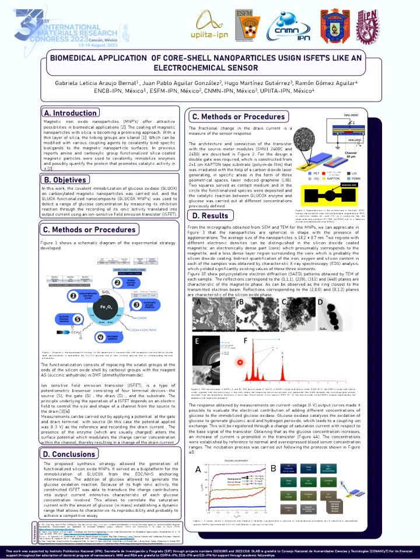The indirect quantification of iron, oxygen, and silicon content in each sample was obtained through energy dispersive X-ray spectroscopy (EDS) analysis, yielding significant values of these three elements.